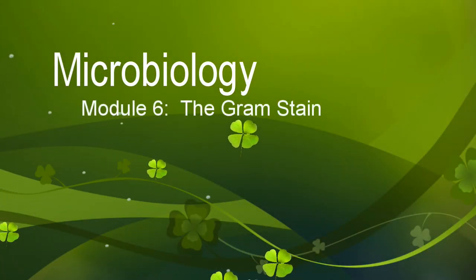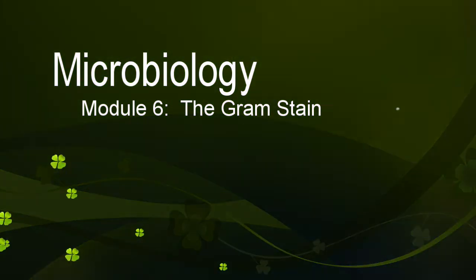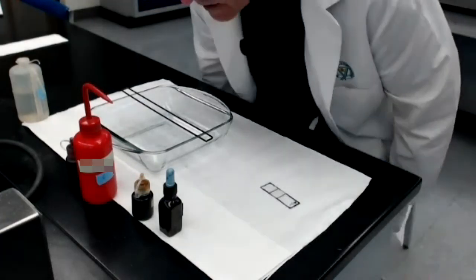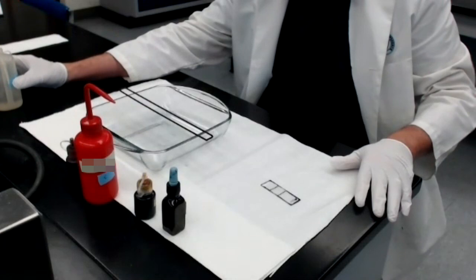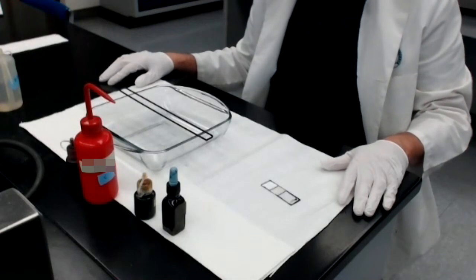Welcome to the video for Lab Module 6, the Gram stain. This is the video for Lab Module 6, Gram staining.